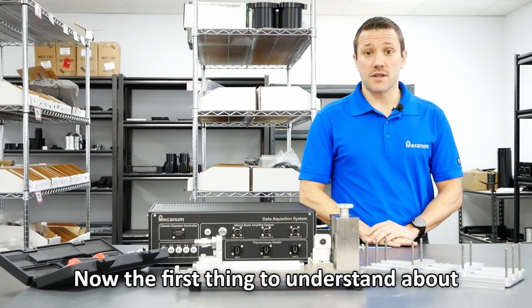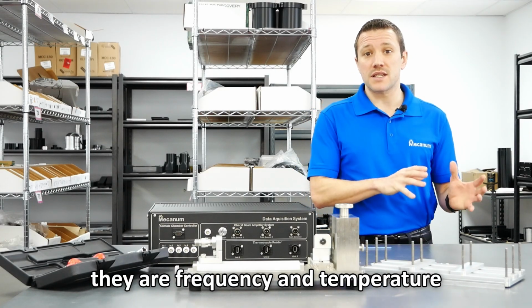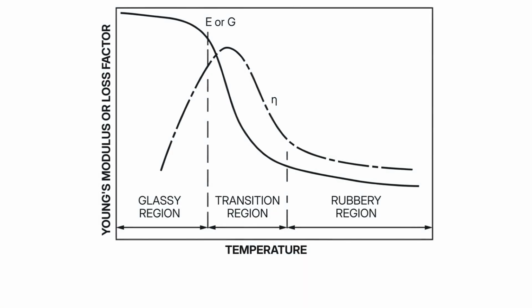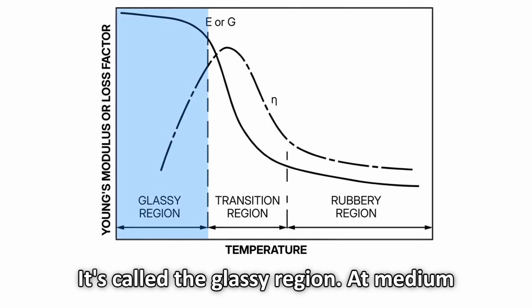Now, the first thing to understand about viscoelastic material properties is that they are frequency and temperature dependent. So when the material is cold, the material is hard, the Young's modulus is high, and the damping loss factor is low. It's called the glassy region.